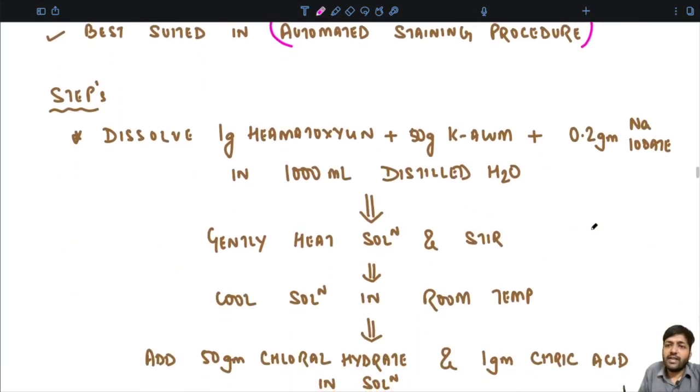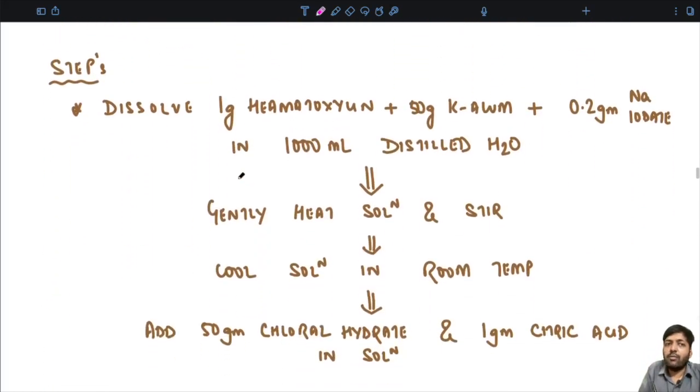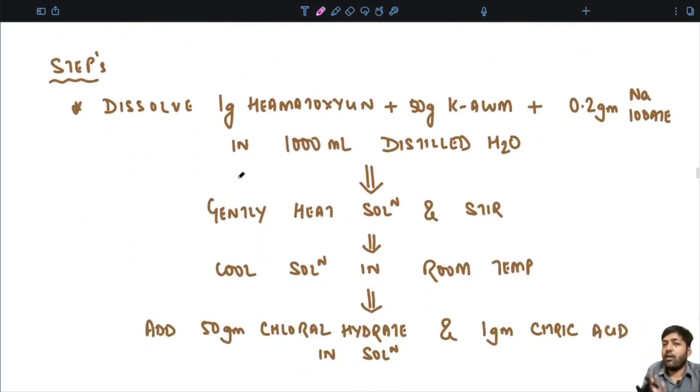How do you prepare this Mayer's hematoxylin? Again, you don't have to remember the steps in detail, but these other points you have to remember, and you have to remember only those steps which are carried out in your particular institute. I am just telling you the standard procedure for making the Mayer's hematoxylin.